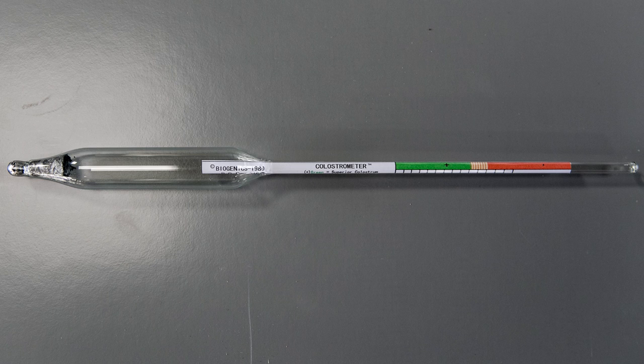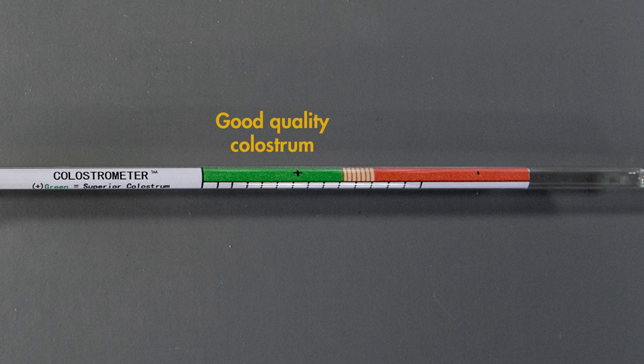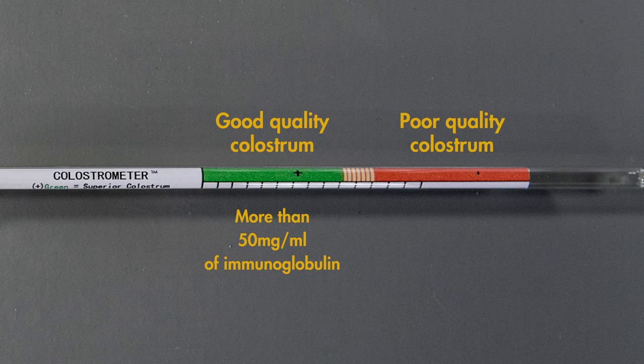If after 1 minute the reading is in the green zone, this indicates good quality colostrum. The concentration of immunoglobulin is over 50 milligram per milliliter, and this colostrum should be used or stored. If on the other hand the reading is in the red zone, this indicates poor quality colostrum, with a concentration of immunoglobulin of less than 20 milligram per milliliter. This colostrum should be discarded.